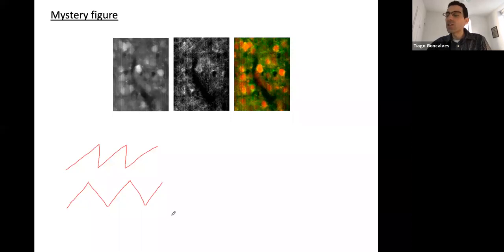The problem is that this is not as repeatable as setting the mirror back to 0 all the time. Because your mirror has a little bit of trouble aligning the backwards motion with the forward motion, you get these artifacts, and you need to correct them in the computer. This is a very common artifact that you see in images acquired with scanning systems. It is faster to scan on both the forward and the back motion of the mirror, but sometimes it can lead to alignment artifacts, which is what you see here.